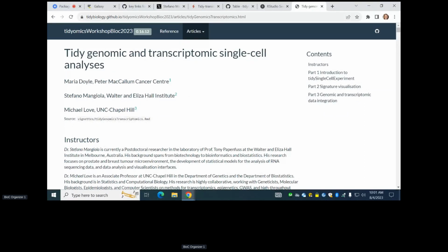All right, so this workshop will introduce, we have done workshops before in many circumstances and places, about the tidy adapters for transcriptomics and genomics. And in this workshop, we would like to introduce the community we are trying to build, as well as how all this tidy infrastructure for Bioconductor can interact on the genomic side and transcriptomic side. And a lot of development has been going on for cytometry and proteomics and so on.